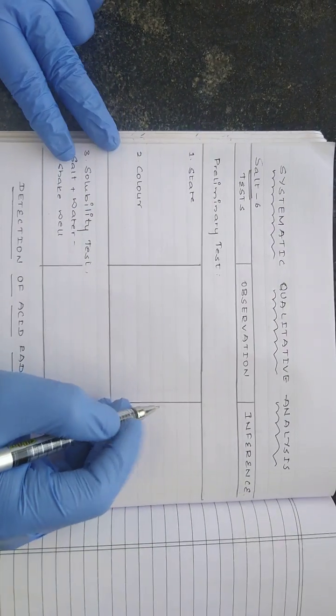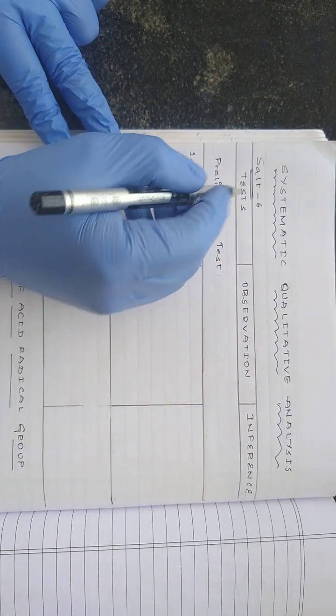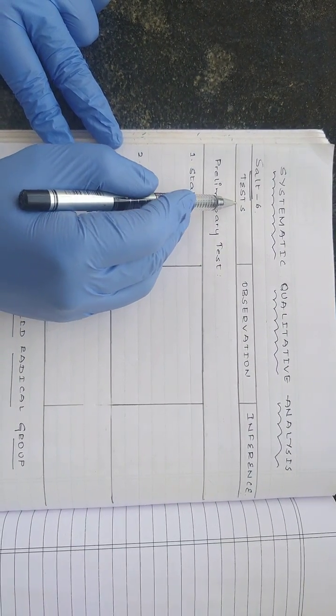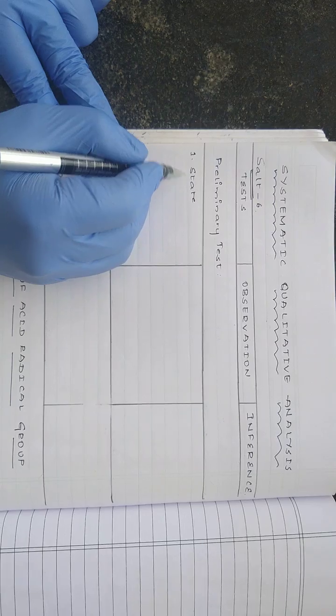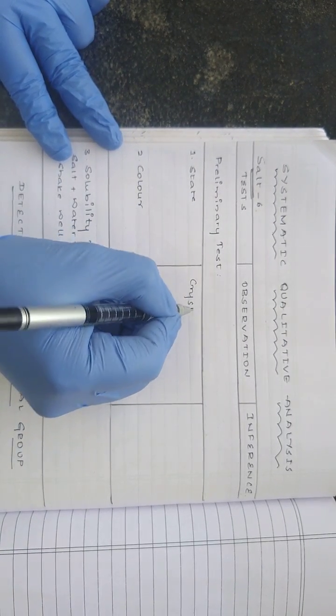So let us write it down in the notebook. Systematic qualitative analysis, salt number 6. We make 3 columns: test, observation, inference, and we begin with the preliminary test. The first was the state. The state of the given salt was crystalline.